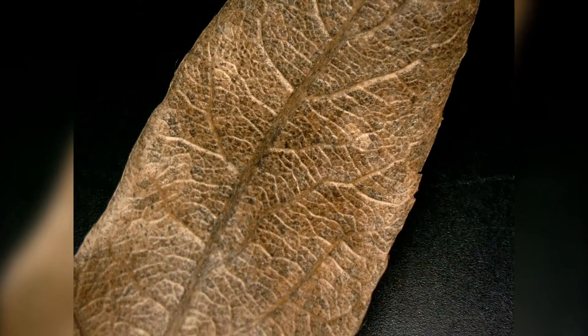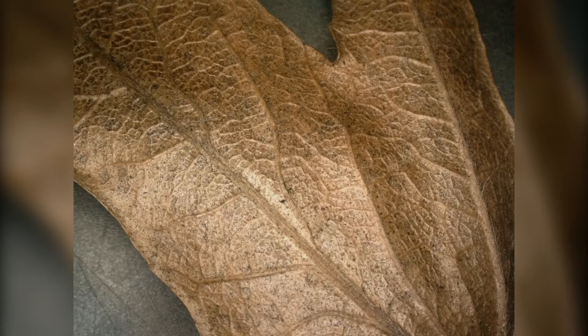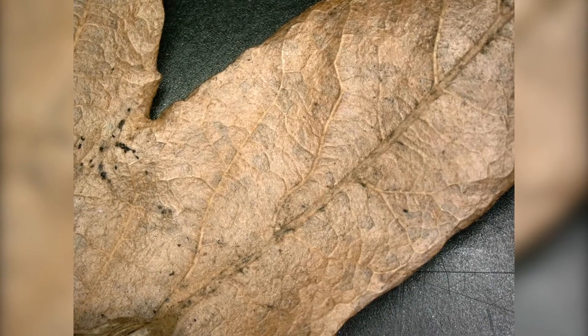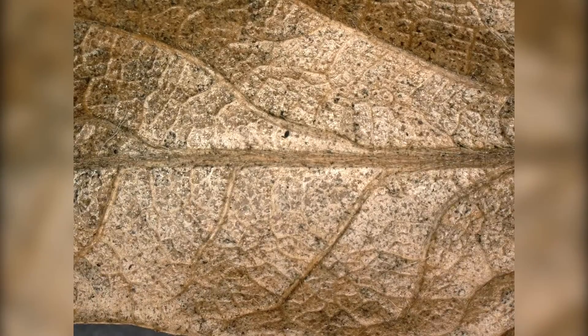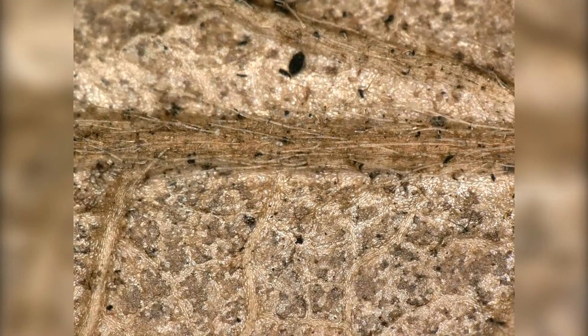Wow, look at those veins — you can see them really clearly now, it's amazing. Let's turn it around. Okay, this side is also really nice. Let's zoom into these veins — you can see the little hairs.